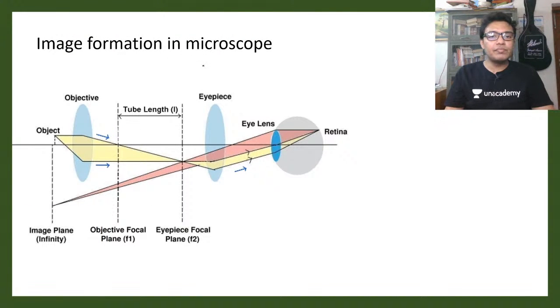So all about this microscope image formation was discovered by Ernst Abbe and then modified by many other people. Okay? So we'll also look at what type of questions are asked in GATB, whether we can answer them or not after this class. So stay tuned for this, only 30 minutes, and it would give you a lot of benefit, okay? So this is how a microscope working principle would look like.